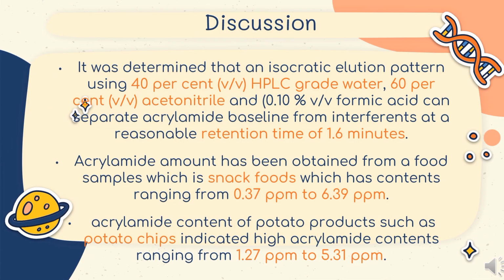My name is Ardini. For the discussion part, this experiment used an isocratic pattern of 40% HPLC grade water and 60% acetonitrile. The retention time obtained is 1.6 minutes. Acrylamide concentration was obtained from snack food samples ranging from 0.37 ppm to 6.39 ppm. For potato chip snack food, this experiment shows that potato chips have a high concentration of acrylamide, ranging from 1.27 ppm to 5.31 ppm.